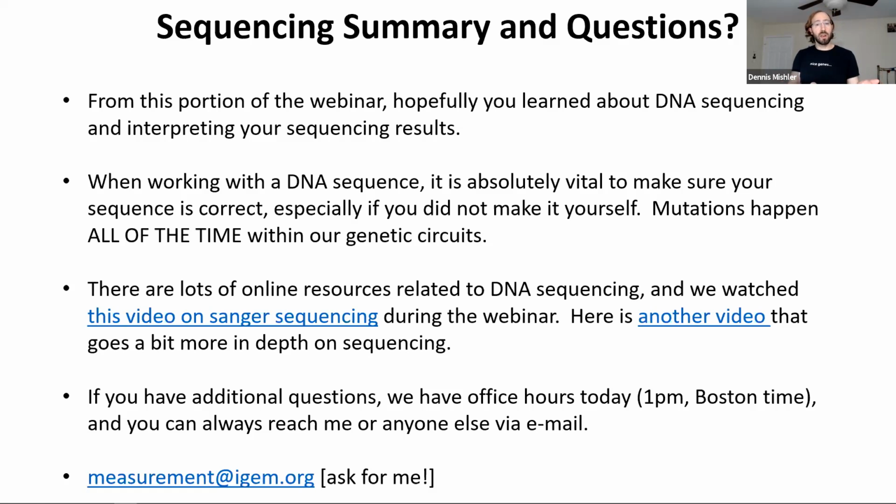We quantitated our DNA, and our DNA is at 200 nanograms per microliter. So now we have to dilute the DNA to 20 nanograms per microliter in the volume they've specified, 10 microliters, okay? So we have to do a dilution, and we do some math to figure that out. So yes, we always send in the same volume of DNA, but sometimes we have to dilute our plasmid into water before we send that in, okay?